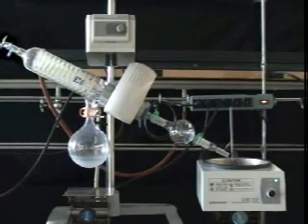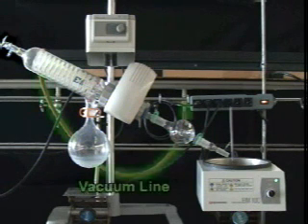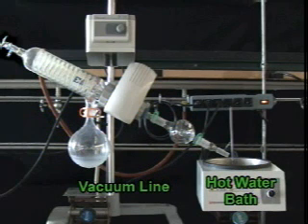While Rotavaps come in a variety of different styles, they are all made up of the same fundamental pieces. These are a vacuum line to reduce the pressure inside of the whole Rotavap system. Remember, solvents boil at lower temperatures under reduced atmosphere. A hot water bath used to warm the flask containing your dissolved material. Evaporation is a cooling process, so you need to add a little heat to evaporate the solvent.